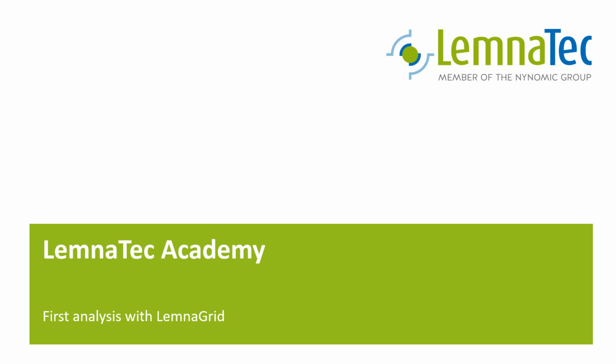In this video, we will create our first image analysis. This will be a simple one using only well-behaved example images. Nonetheless, we will demonstrate some basic concepts of image analysis with LemnaGrid. So let's get started.